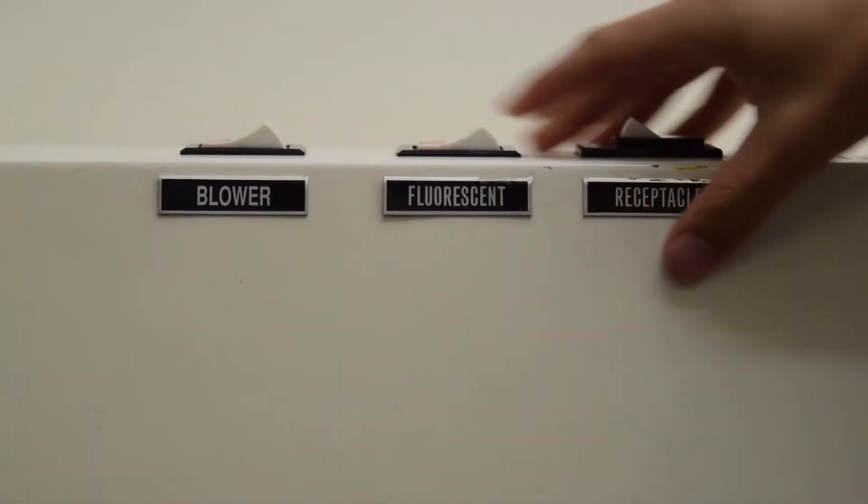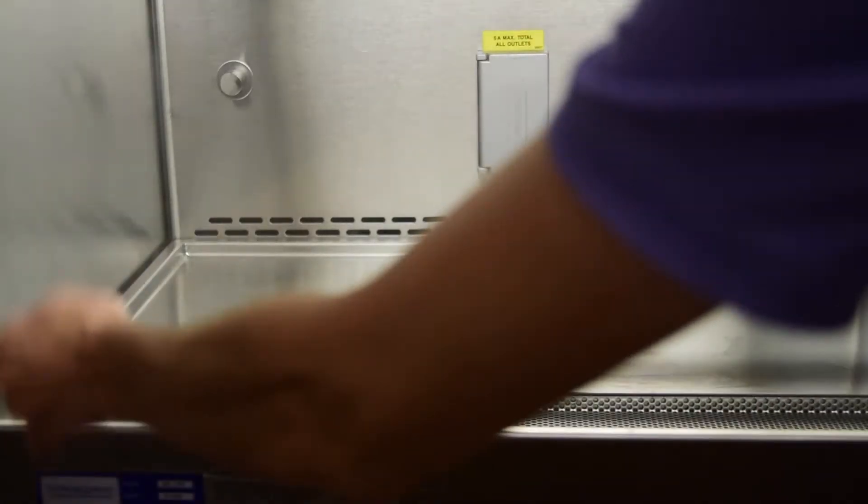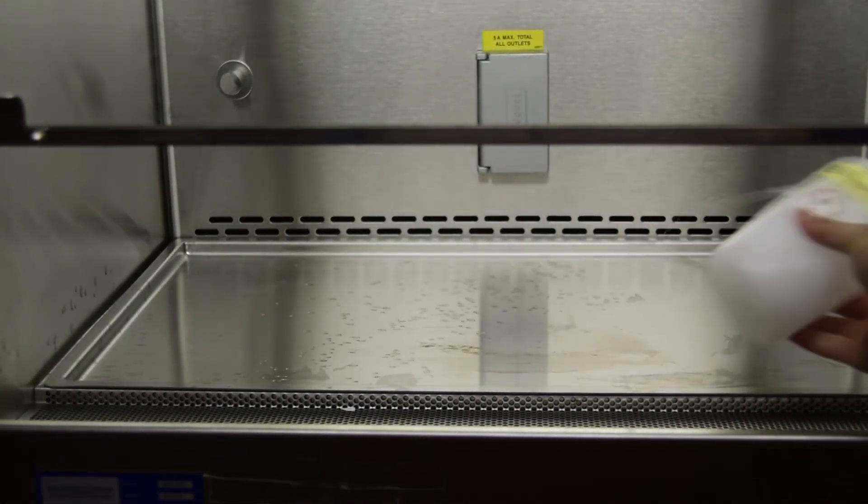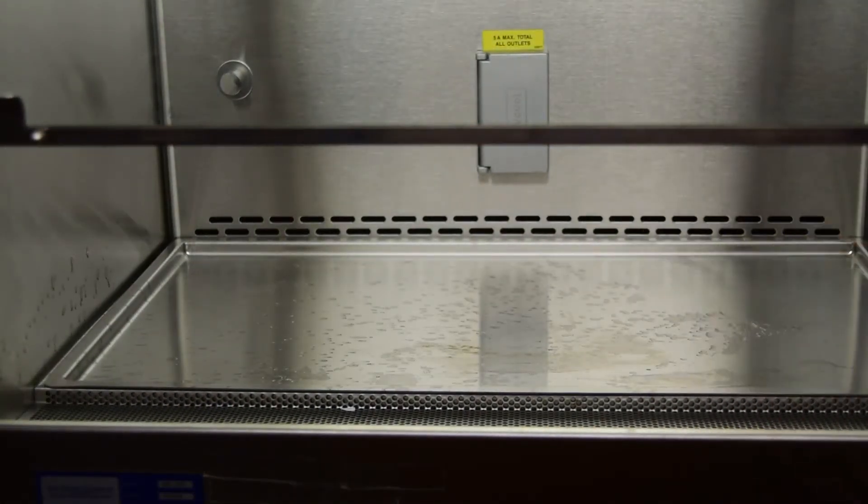Turn on all three switches for the hood in the lab's main space, open the sash to the safety line, and clean the surface with ethanol. This hood can be used for isolating environmental fungi.